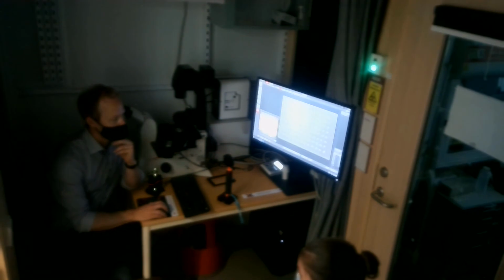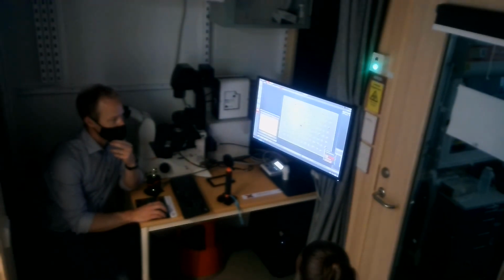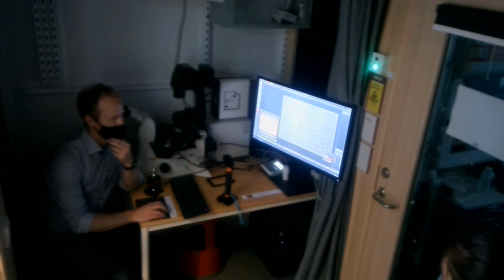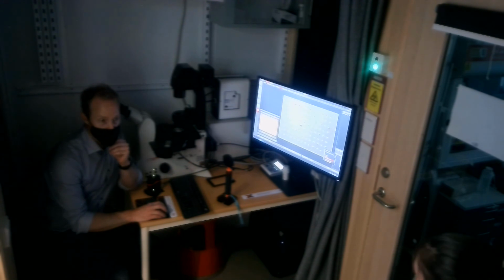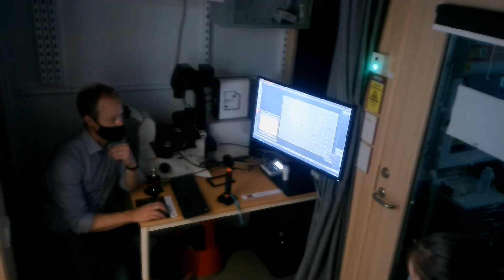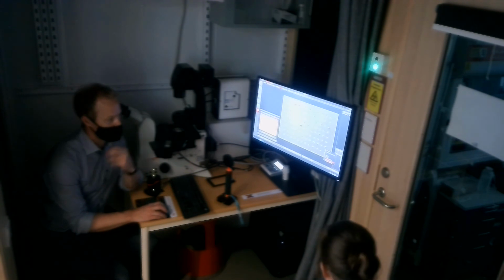You can also right click here and then save and load regions. So you can save these regions, so that will just save the regions, not the full experiment. You can save that together with the focus map, if that's something that you do. So you have those options also. And a bunch of other options, you will see it if you right click, and if you want to explore what they do, most of the time they are quite well described.